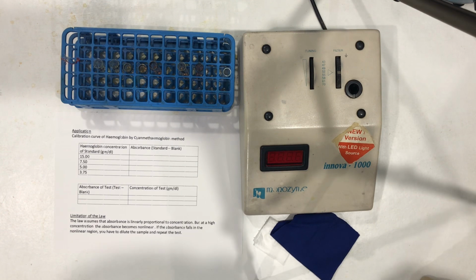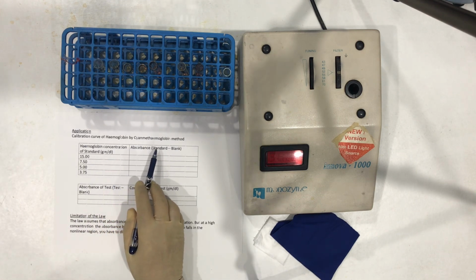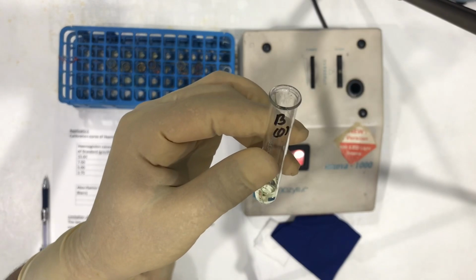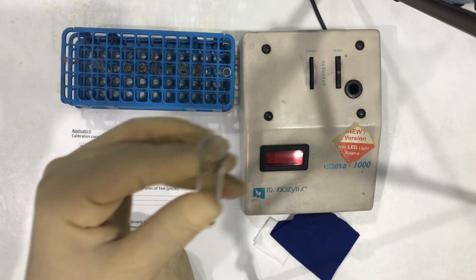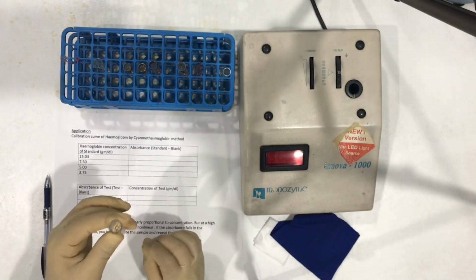Application of Beer Lambert law. Let us see how the absorbance increases with concentration. Out here, we will see the calibration curve of hemoglobin by the cyanmethemoglobin method. This is our blank containing no hemoglobin. This is our standard containing 3.75 gram of hemoglobin per deciliter.